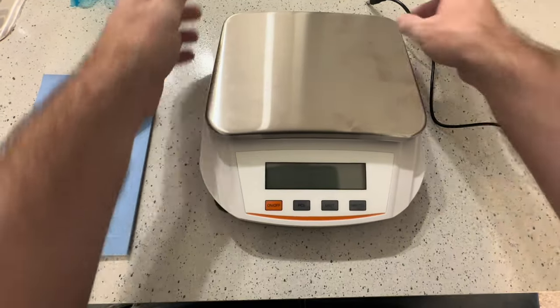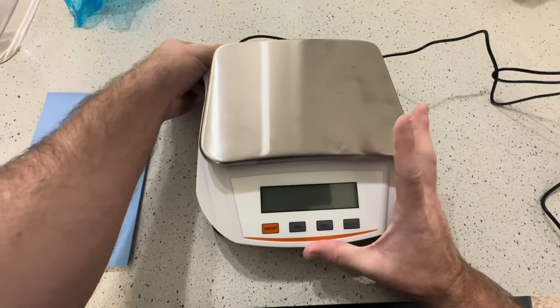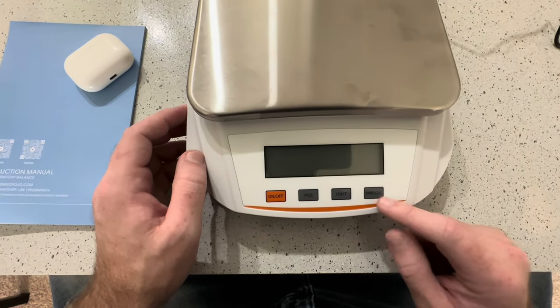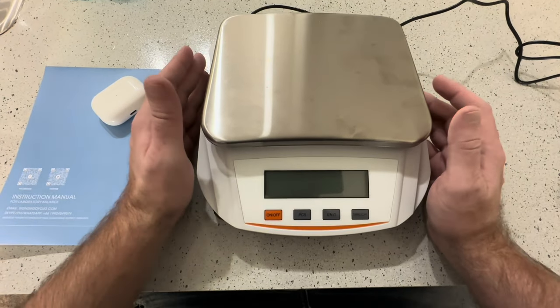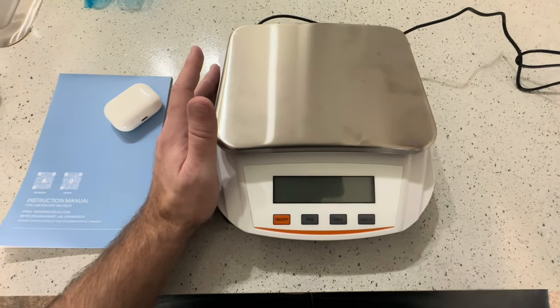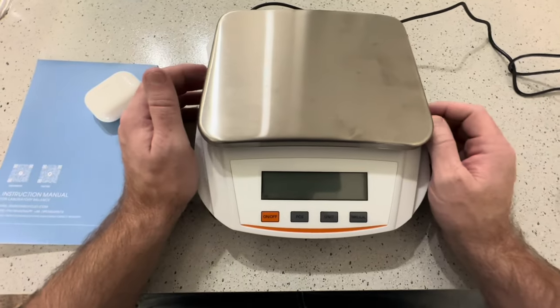I really like how simple it is — it can do so many different types of weights and you only have four buttons, so it's super easy. You could use this in your kitchen as well as a laboratory. There are lots of other uses for a very precise scale like this, so definitely one to check out if this is what you're looking for.